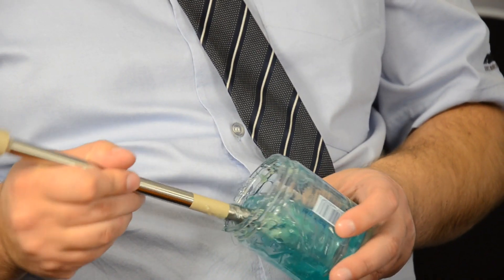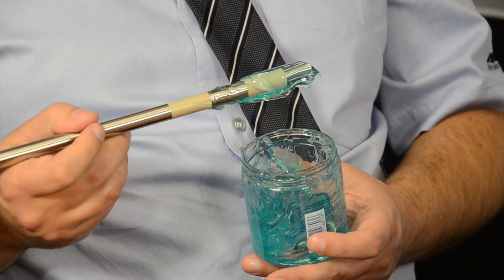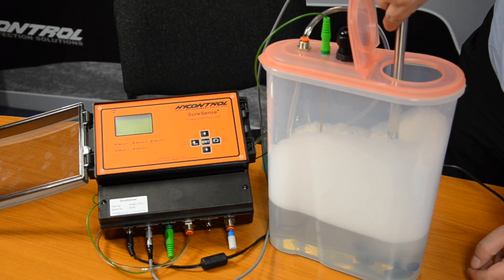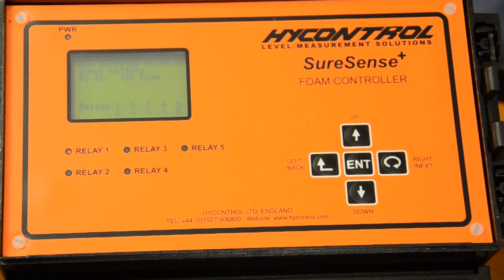Another key issue when detecting foam is fouling. Our probe is immune to fouling because it utilizes our patented IMA sensing. As you can see, our probe can handle buildup that would seriously affect the performance of another probe.